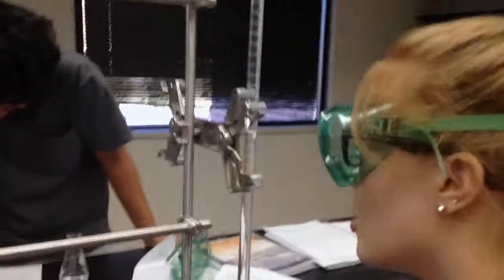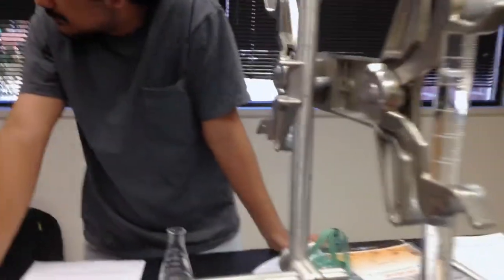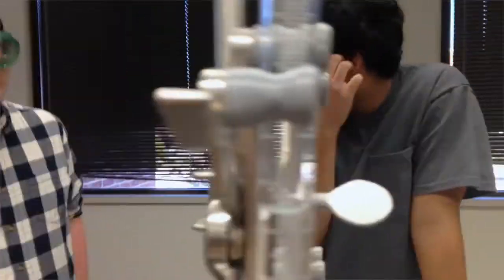Here we see that it is a faint pink color now, and we are at approximately 31.50 milliliters.